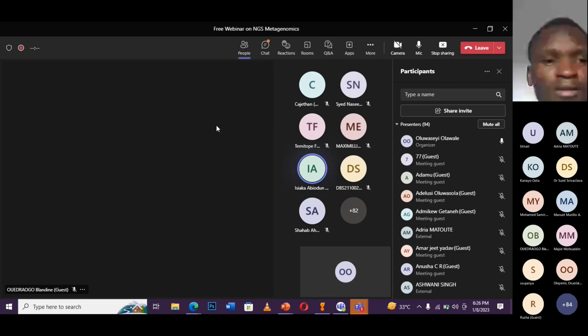Yeah, currently I don't know if there are more than one or different bacteria. There is no information currently. So just to identify them and do a taxonomic study, what should I do? Now, if you are working with a particular sample and you believe that there are a lot of organisms in them, a lot of bacteria in them, you can do a metagenomic sample.